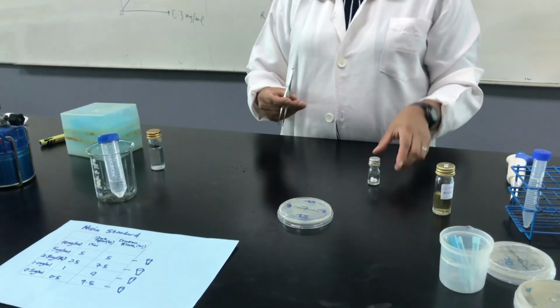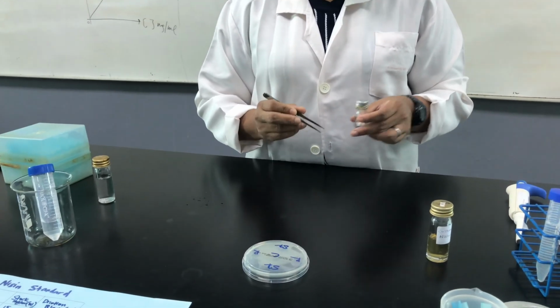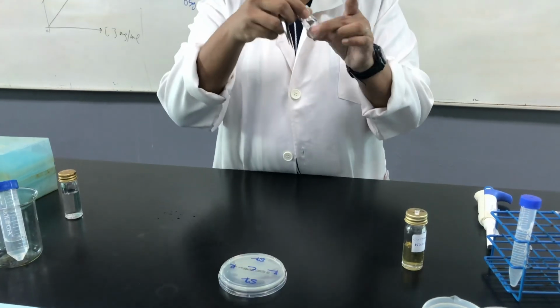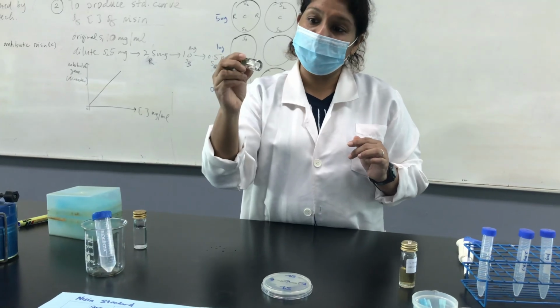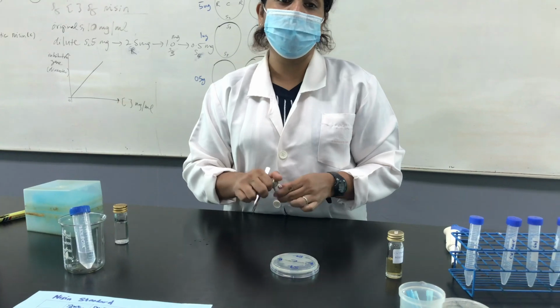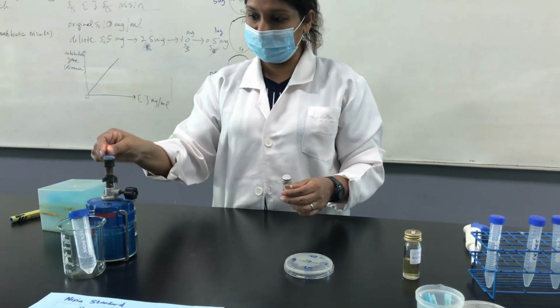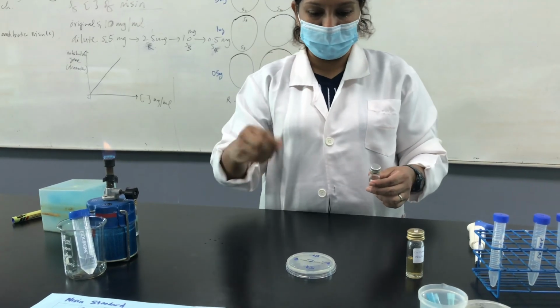Okay, so this is the process where we put the Nisin from the stock culture as well as our own produced culture. We dip the Nisin into this antibiotic disc, sterile paper disc. Okay, and then we inoculate into the Petri dish so that we will see a zone of inhibition. Okay, so then again, aseptic technique is very important. So work near your fire, sterilize the forceps. Okay, sterilize the forceps, cool it down.